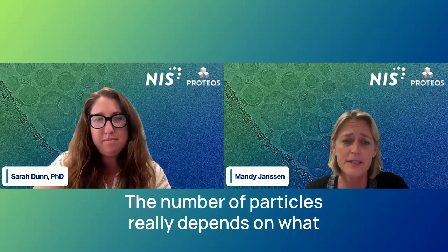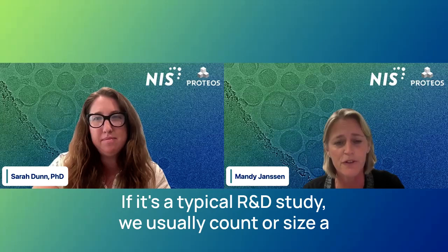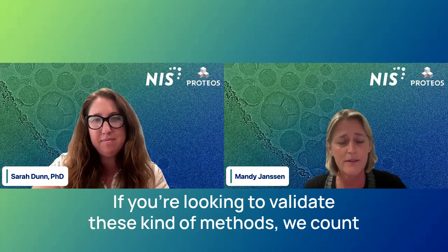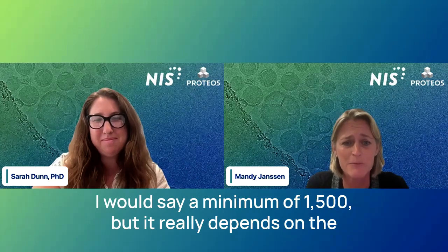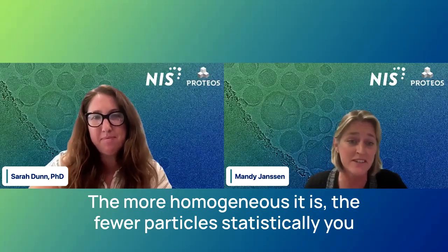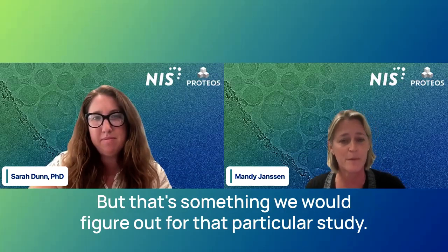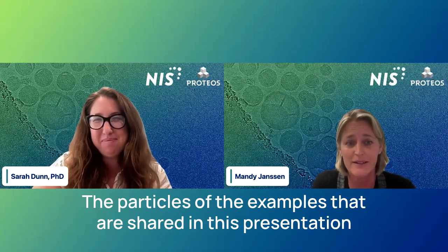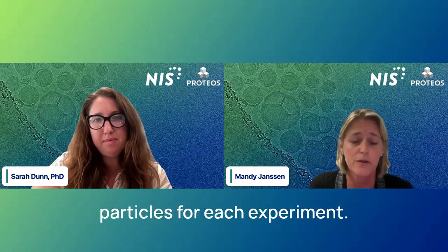The number of particles really depends on what kind of study we're doing. If it's a typical R&D study, we usually count or size a minimum of 250 particles. If you're looking to validate these kind of methods, we count a lot more particles, usually I would say a minimum of 1,500, but it really depends on the homogeneity of your sample. The more homogeneous it is, the fewer particles statistically you need. The more heterogeneous, the more particles you need. But that's something we would figure out for that particular study. For the examples shared in this presentation, we used between 1,000 and 1,500 particles for each experiment.